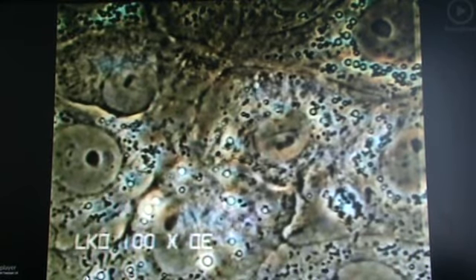This living ciliated epithelium was also taken with the same technique, partly in the complete tissue formation, and partly as a single cell that aimed to bind to the whole formation according to the natural physiological integration, not only in slow motion, but also at normal speed. Ciliated epithelium appears, for example, in the respiratory tract and has the task of transporting foreign particles out of the pharynx.